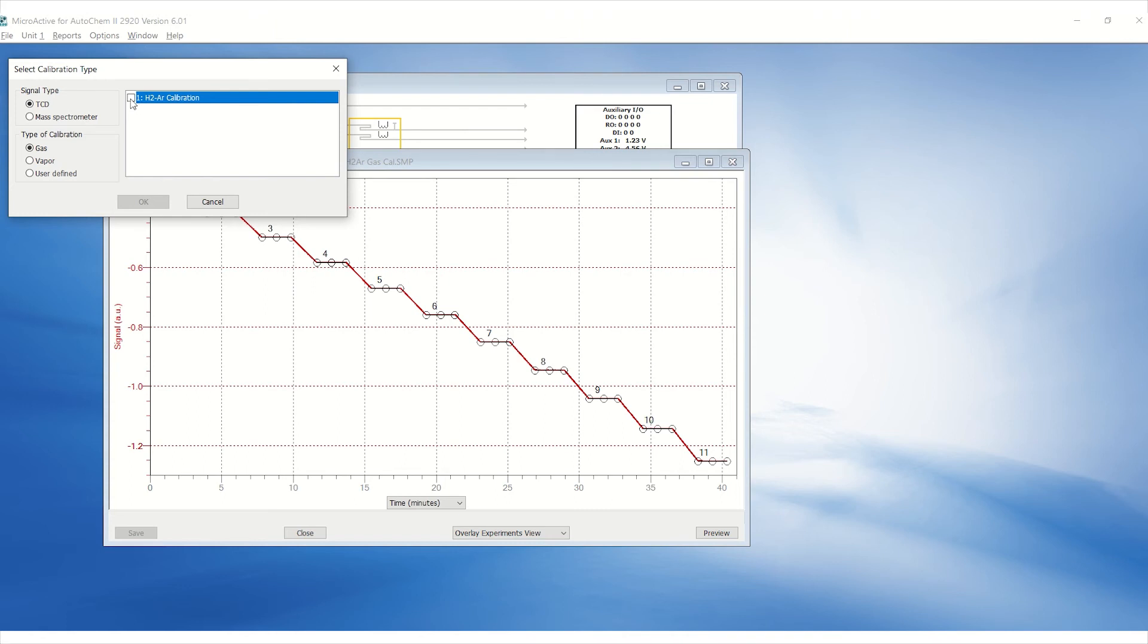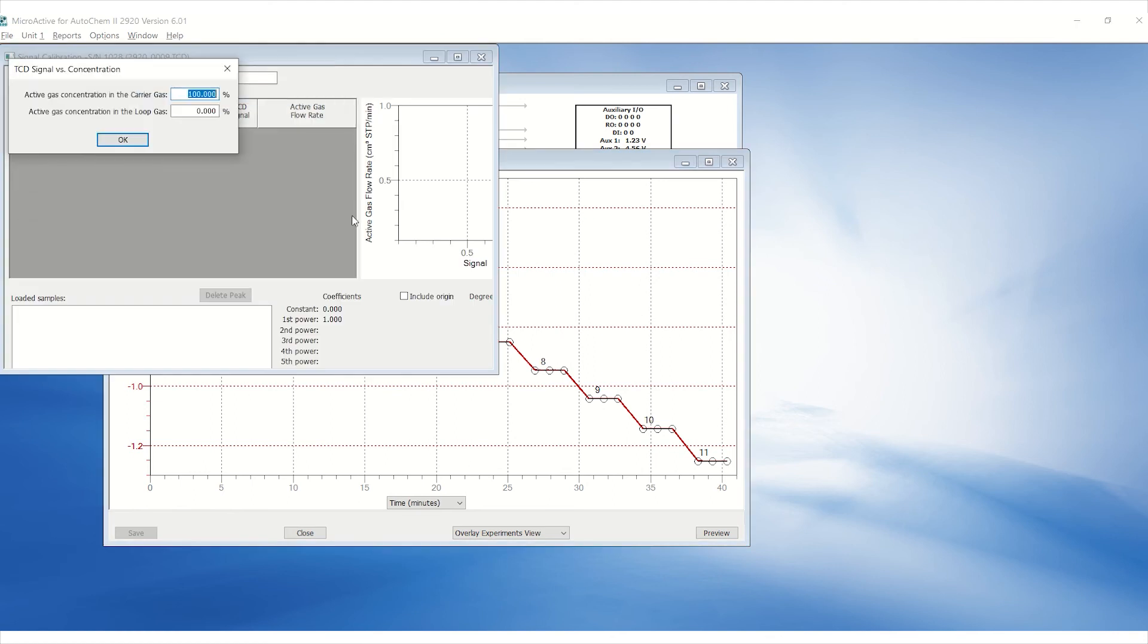Check the box next to your file and click OK. Enter the active concentration in the carrier gas, which can be found on the certificate of analysis of the gas cylinder, and click OK to show the calibration curve.